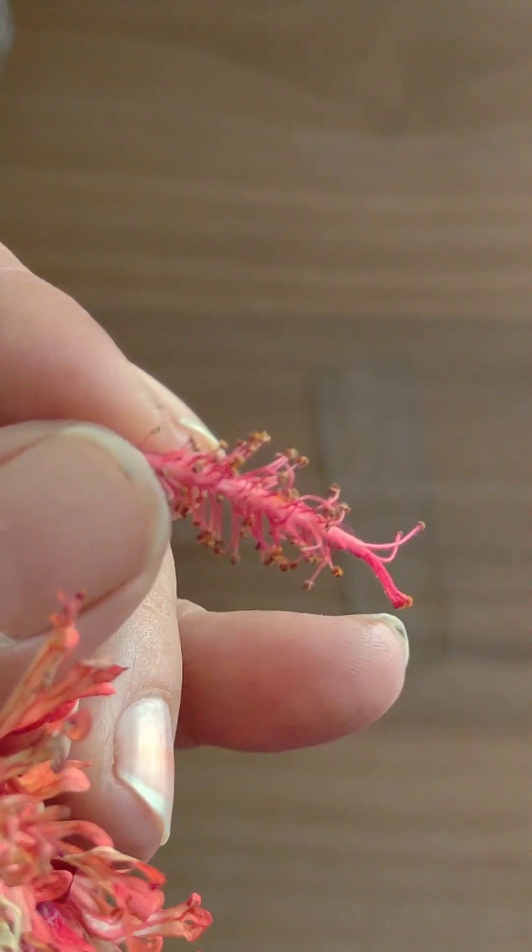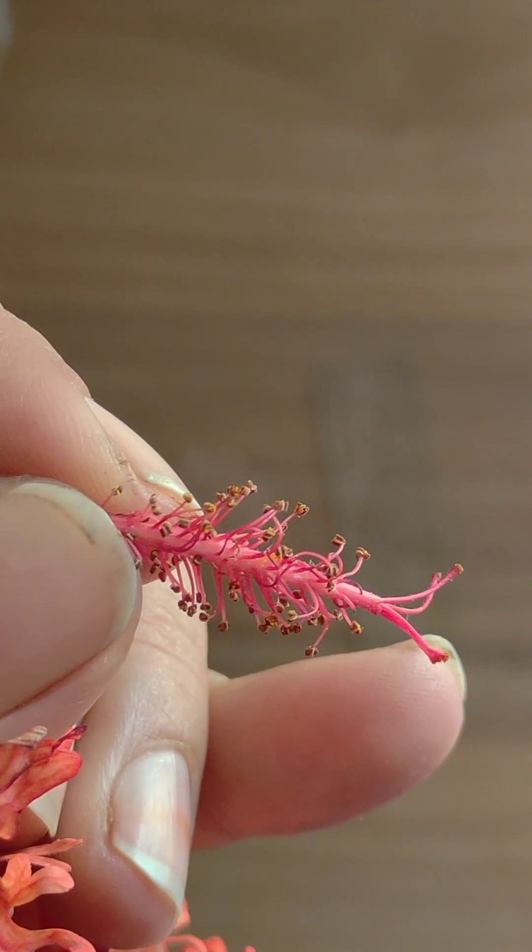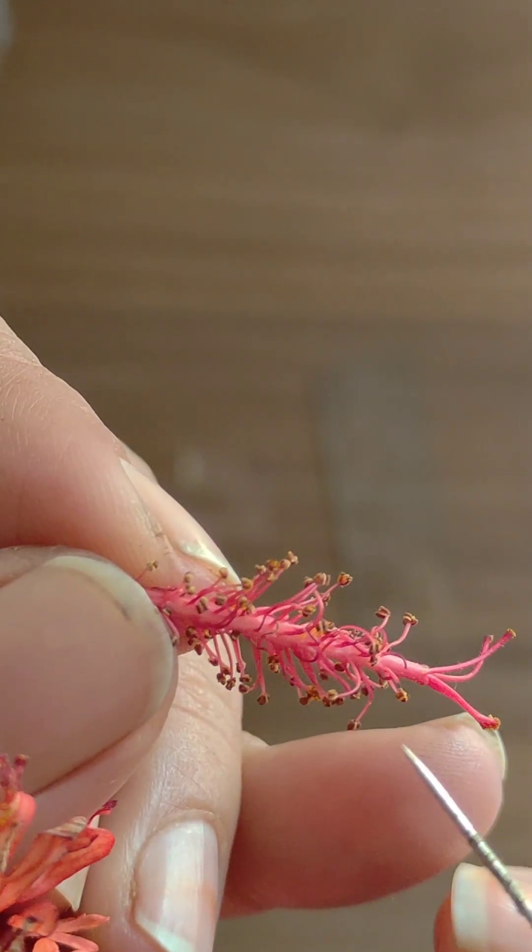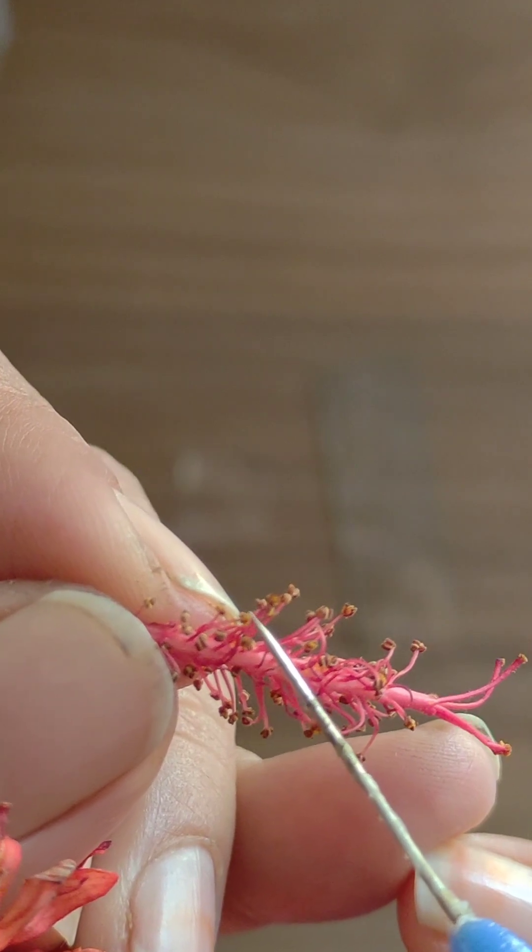First of all, gently remove the pollen grains from the hibiscus plant, flower, sorry. This is the pollen grains.